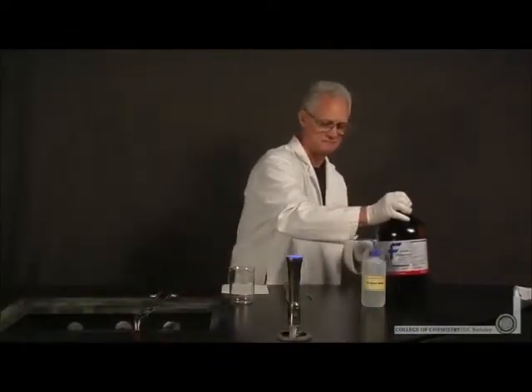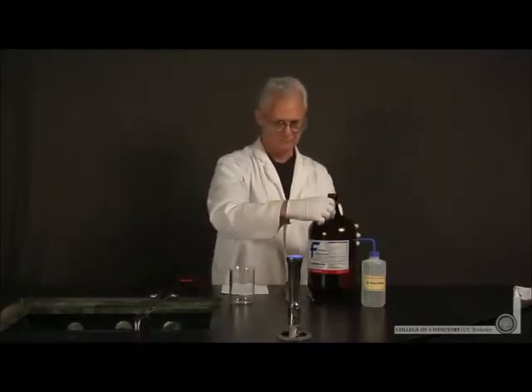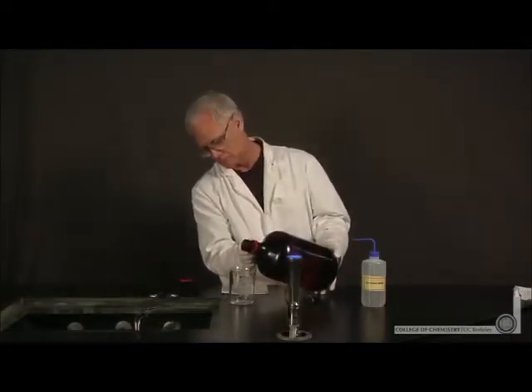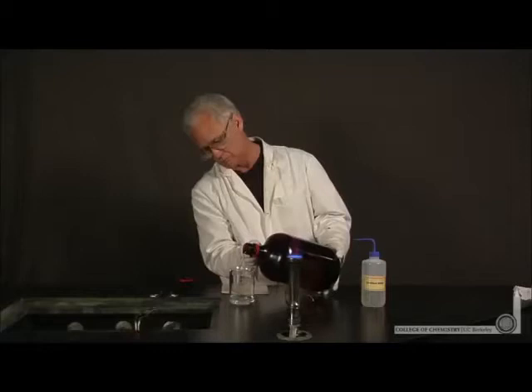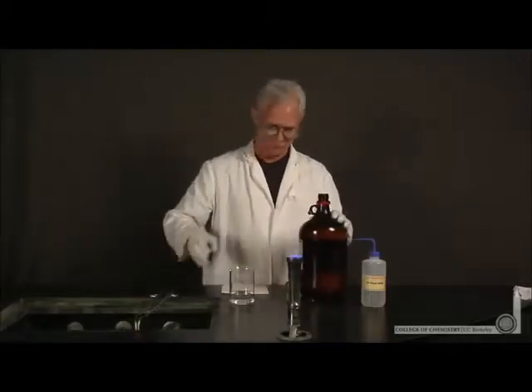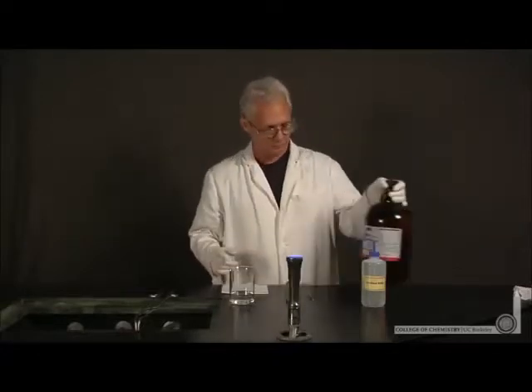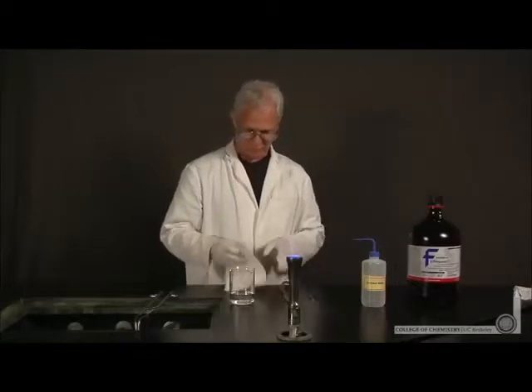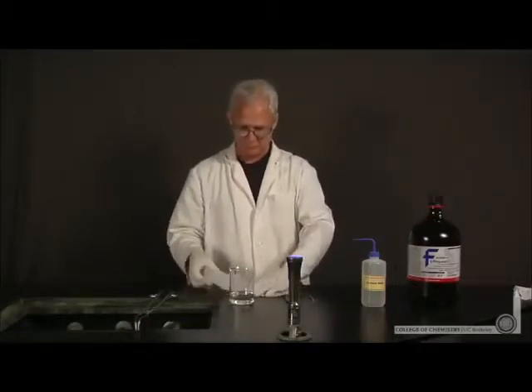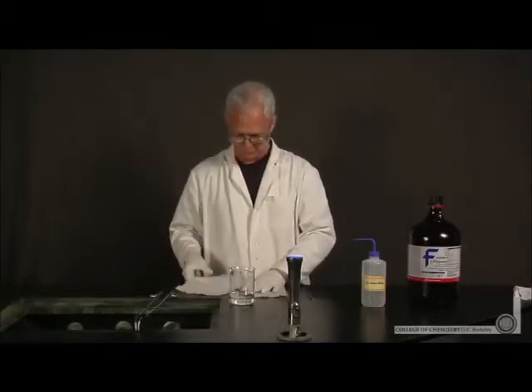We've asked Lonnie to demonstrate the burning of a towel under two different conditions: isopropanol pure and isopropanol water mixture. So first, isopropanol. He'll prepare some isopropanol in a beaker and a towel which he'll saturate with isopropanol that will burn. Now, the flash point of the paper that Lonnie's going to burn is over 500 degrees Celsius. So if that begins to burn, that means the flame is hotter than around 500 degrees Celsius.